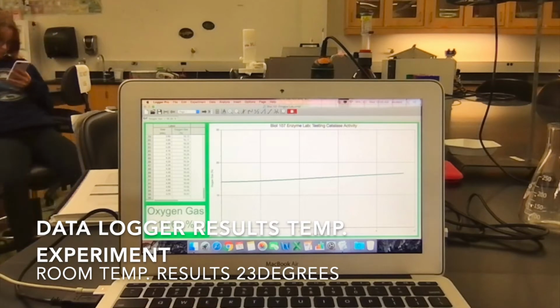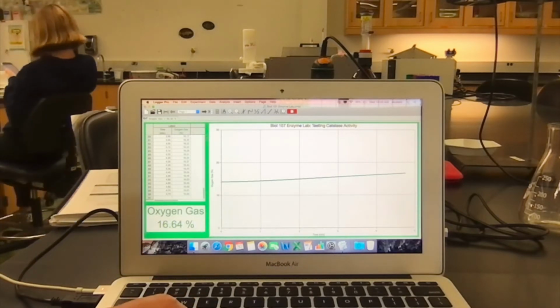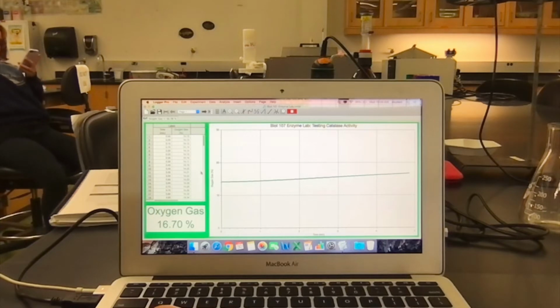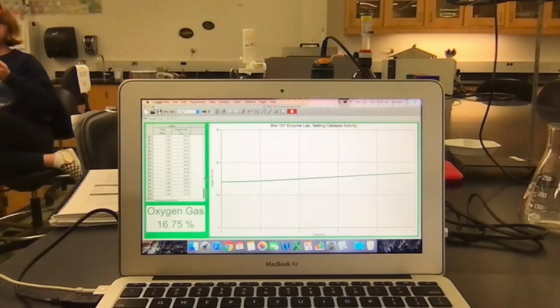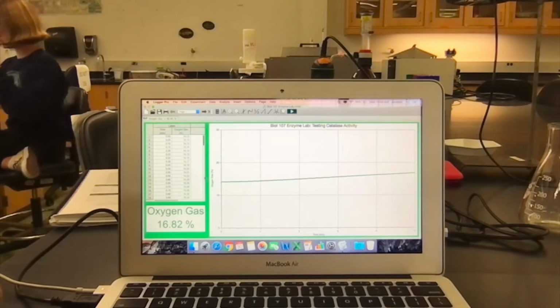So this is the run at room temperature. You can see if you go way up here, which it won't probably let me because it's still running, it started at 14% and it's going to end somewhere around 16%. And I ran the room temperature one first just because I didn't have to wait to equilibrate it in a water bath.